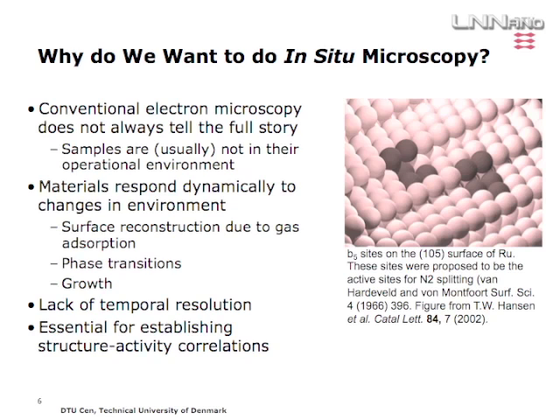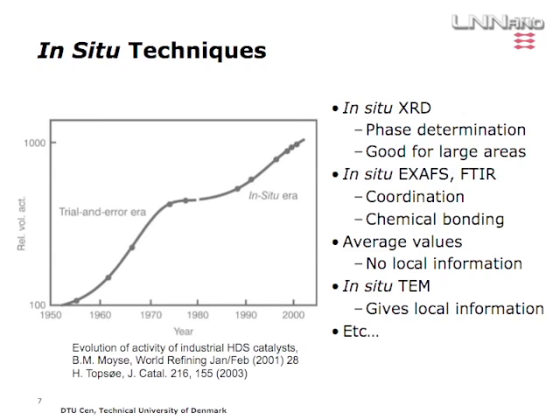Second of all, we don't have any temporal resolution in conventional microscopy. We can't really change anything, so the situation usually stays quite stagnant. So we don't see any effects of time. So doing in situ microscopy is essential for establishing these structure-activity correlations.